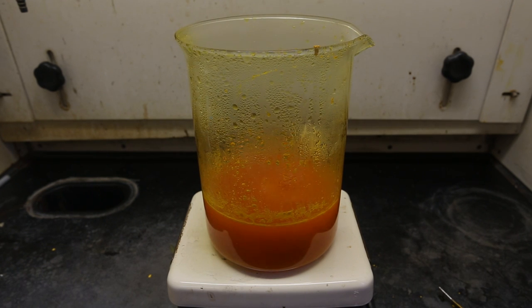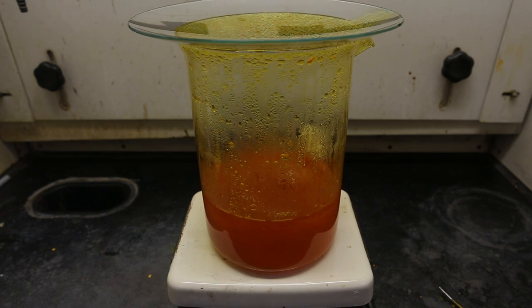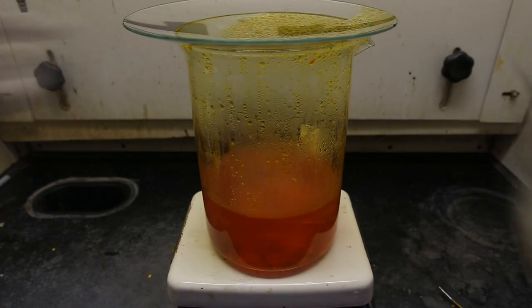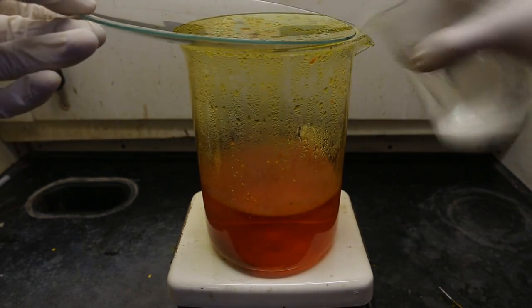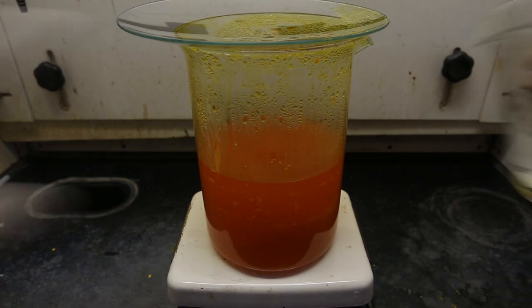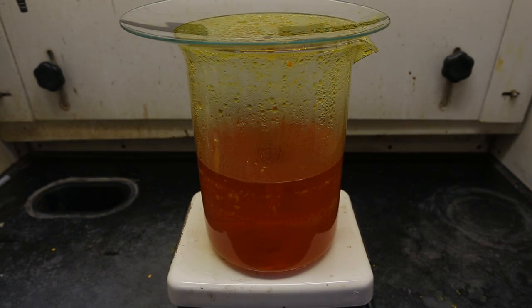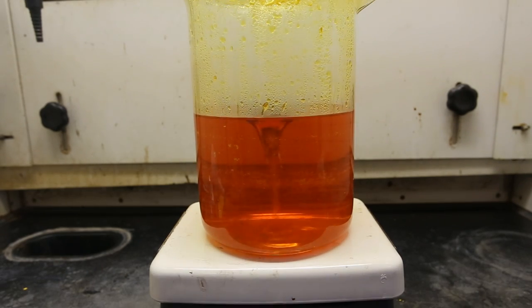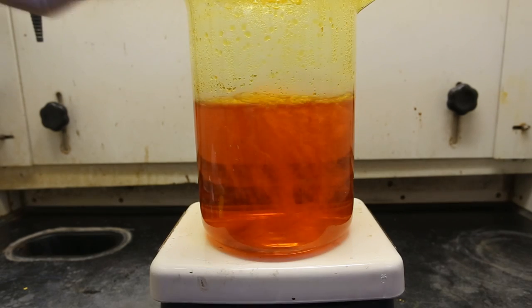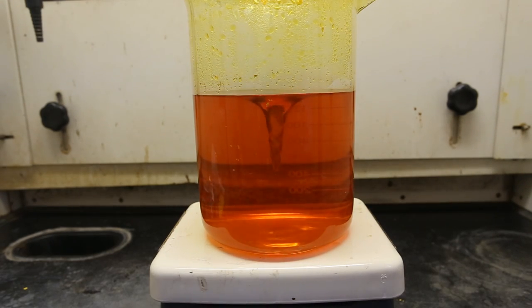I would honestly avoid recrystallizing using water. Your main contaminant in your product is going to be ortho-nitroaniline. However, water recrystallization is not going to do a very good job separating these two isomers. However, if you do not have ethanol available, this recrystallization is better than nothing. However, if you do have ethanol available, this recrystallization is completely useless and a waste of time.